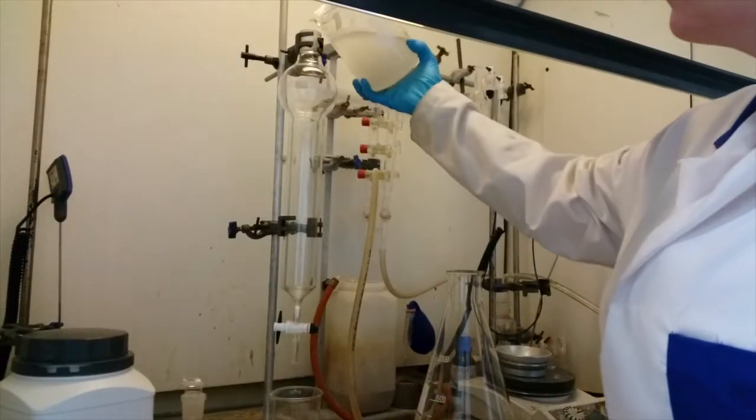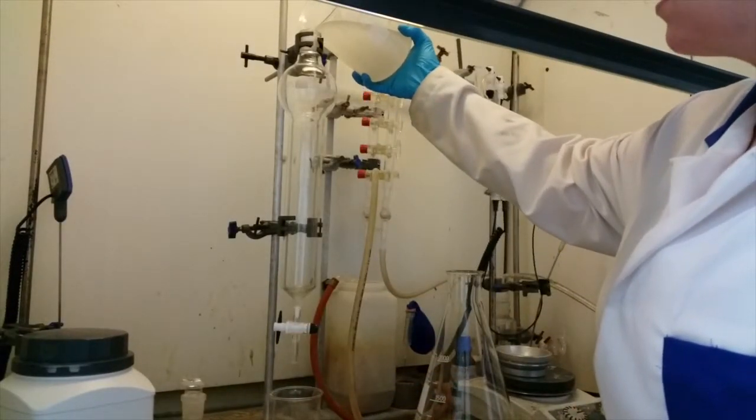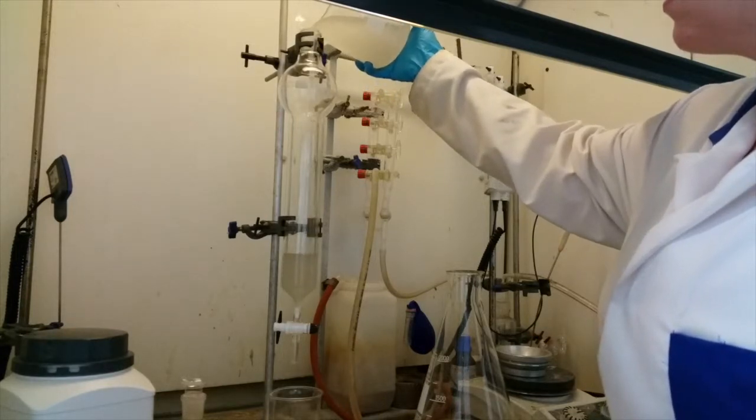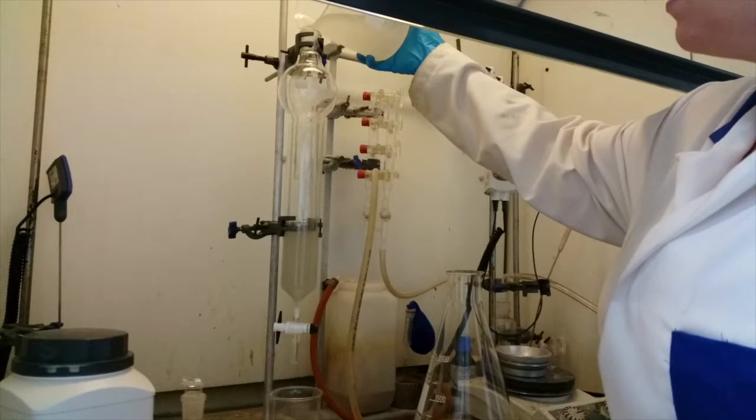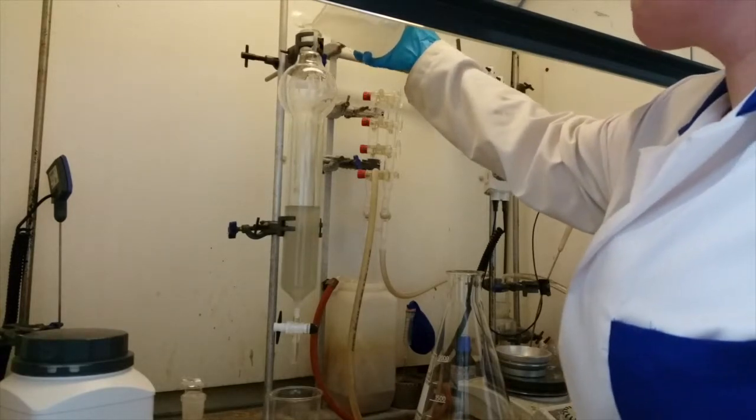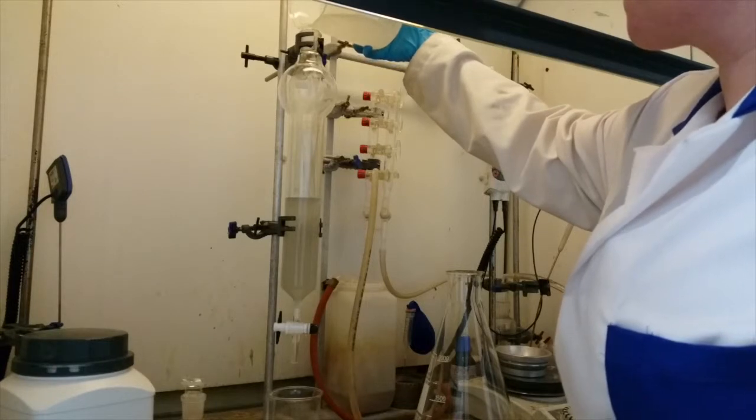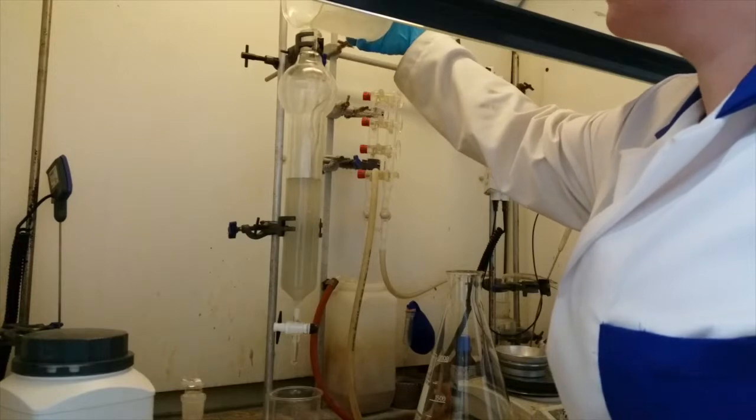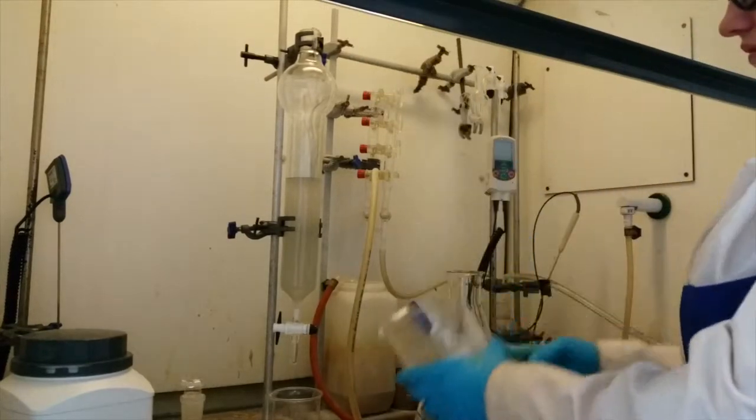Carefully pour your silica slurry into your column using a powder funnel if you're worried about spilling it. The silica will settle a lot during packing so don't worry if at this point the slurry fills more of the column than you expected it to. Often the slurry gets thicker and more difficult to pour towards the end of the beaker. In order to prevent this you can add a little more solvent as you go along to make it easier to pour.